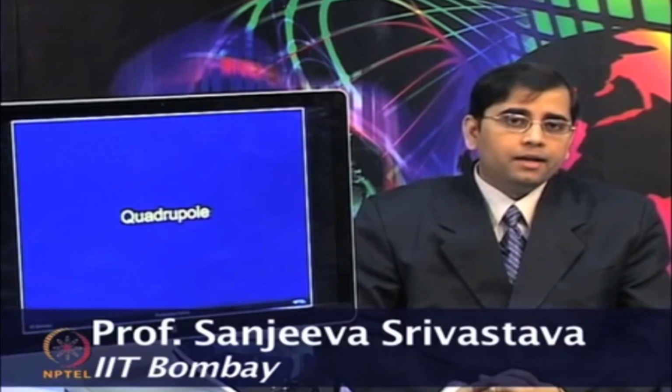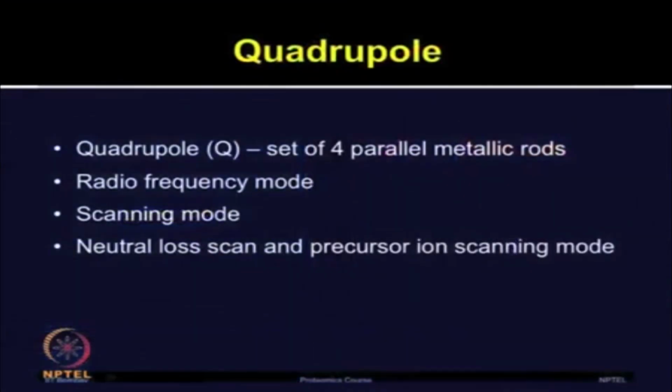It consists of 4 matched parallel metal rods, and mass separation is accomplished by the stable vibratory motion of ions in a high frequency oscillating electric field that is created by applying direct current and radio frequency potentials to these electrodes. So, as we talked, the quadrupole is a set of 4 parallel metallic rods with opposite pairs electrically connected.